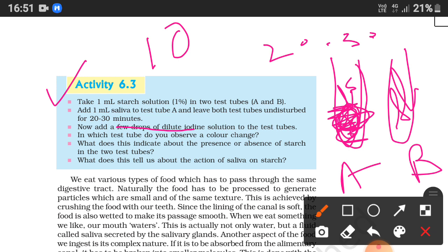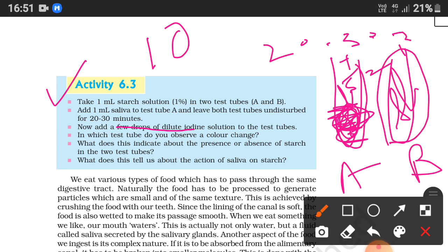In which test tube do you observe a color change? When you add iodine to both, test tube B turns blue-black because we have not added saliva there, so starch is still present.